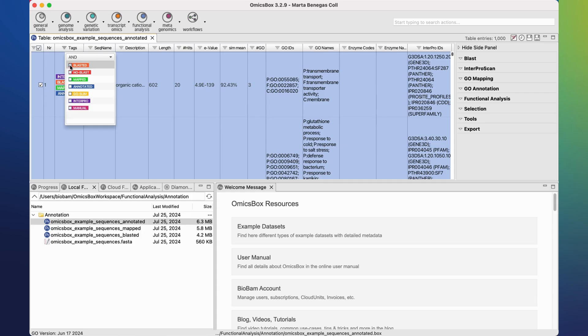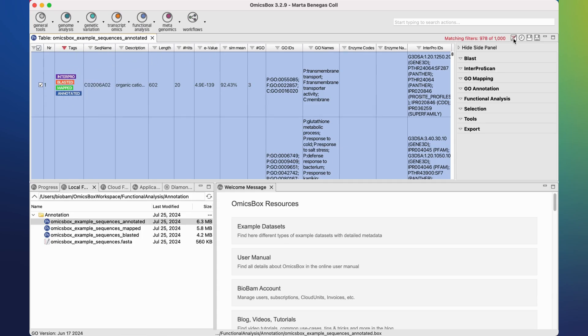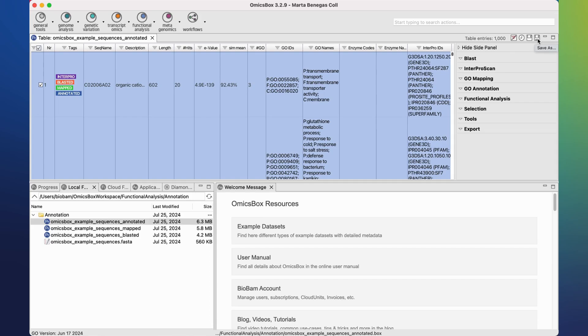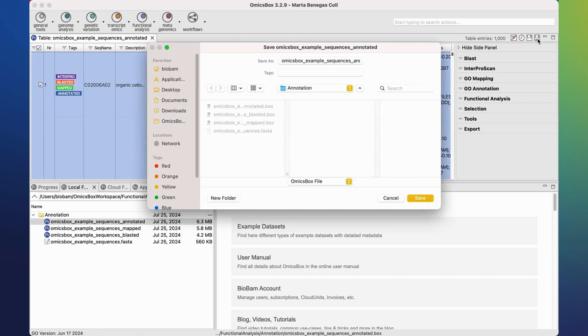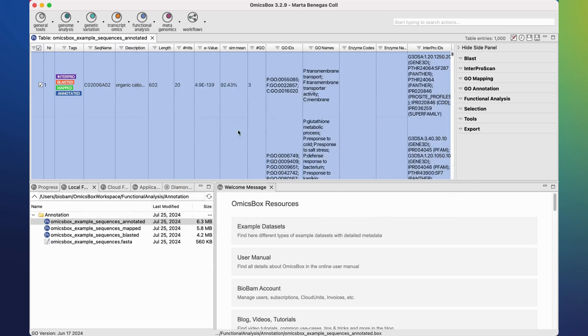Once we apply a filter, it can be removed by clicking on this button on the top right corner. Results can also be saved by clicking on this button. They will be saved in a .box format that can be opened again in OmnisBox.